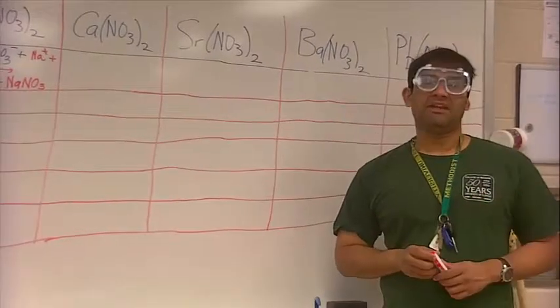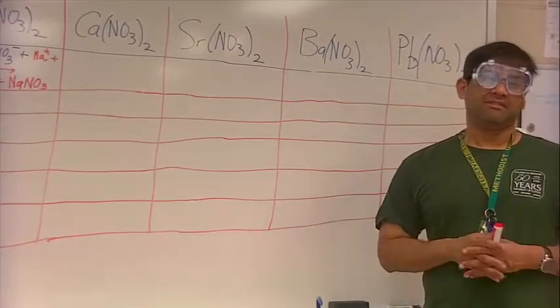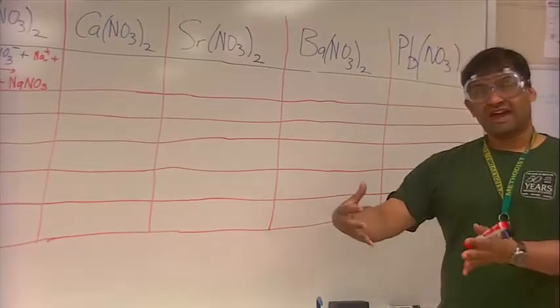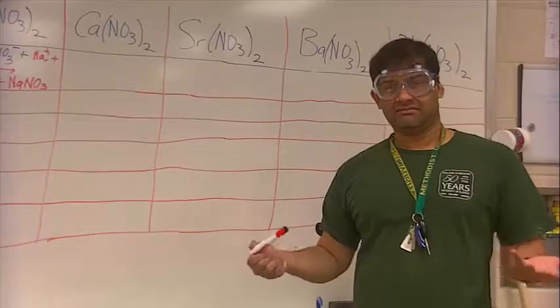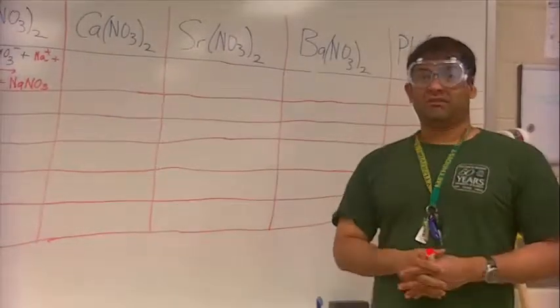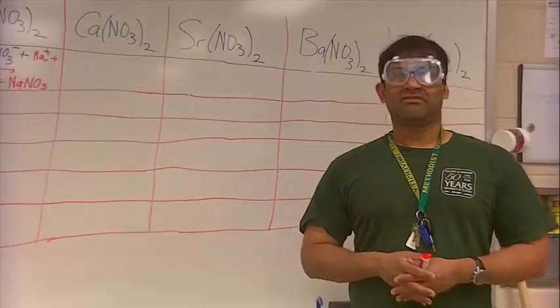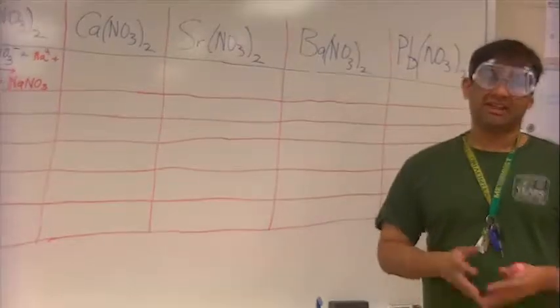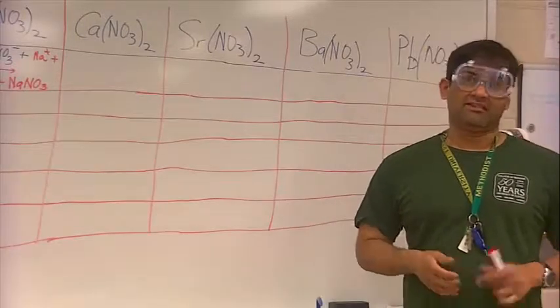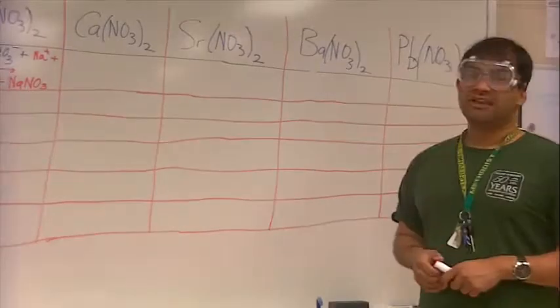And I want to mention in the lab is not only practice safety, but minimize waste as well. So when you make these reactions, have one big waste container, maybe a 250 ml beaker, pour it in, wash with a good healthy wash of tap water and DI water, and then bring it back for your next set of reactions. Clean test tubes all the time when you do your reactions, and always minimize waste. So have a fun lab, have a safe lab, and enjoy doing these chemical reactions.